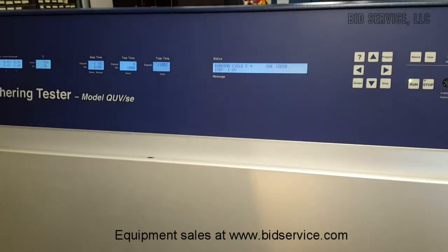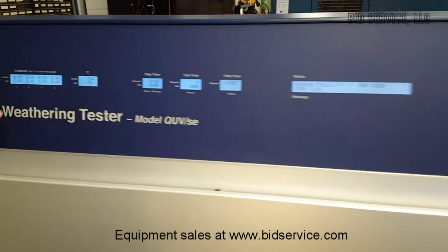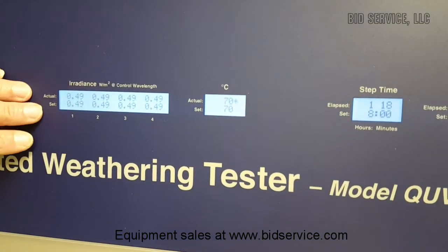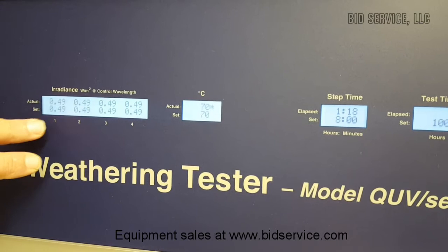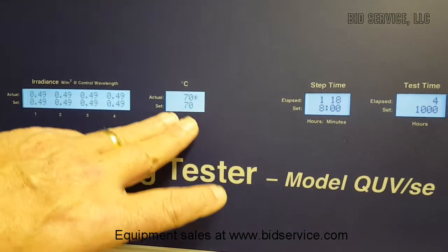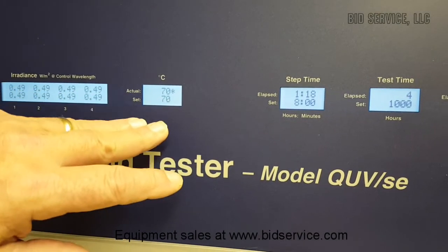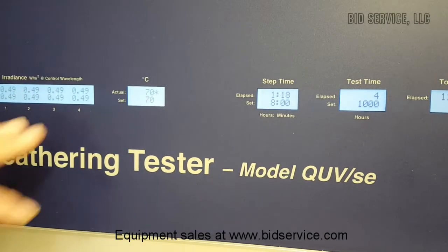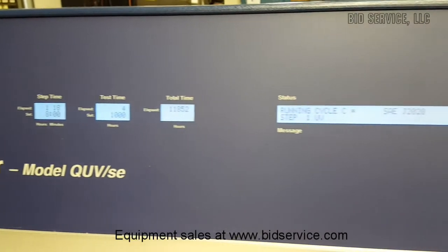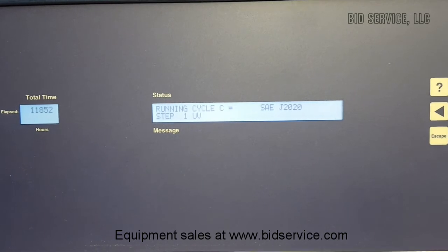I've put the unit into the UV mode. As you can see now, before we had nothing here — we now have set points and actuals for irradiance for the four banks of two UV lamps each. Our temperature now is 70 versus it was 50 in condensation mode, and that's particular to a test. Each test, you can program both of these things depending on what you want. These have changed accordingly and now we're in UV mode versus condensation mode.